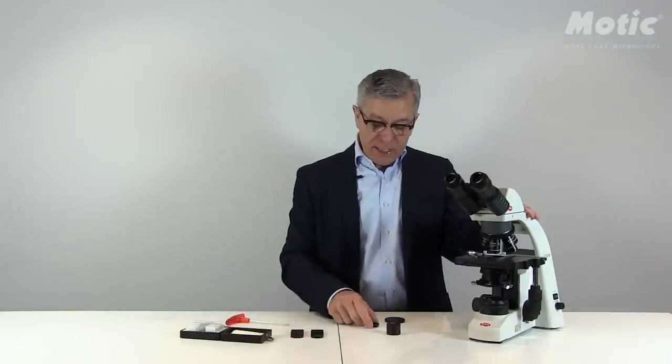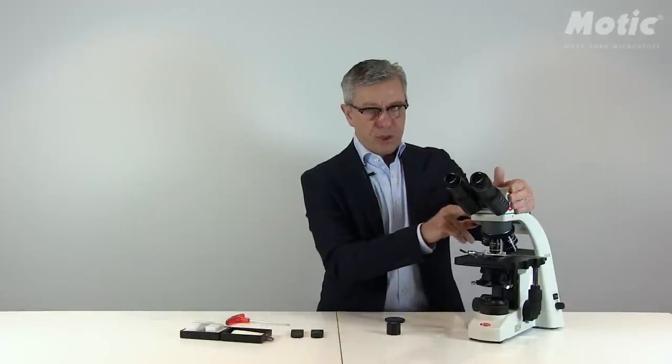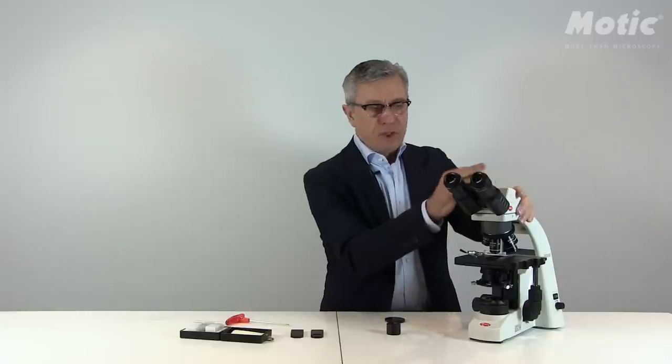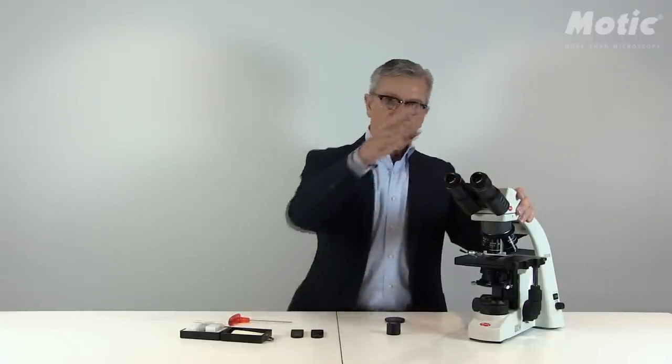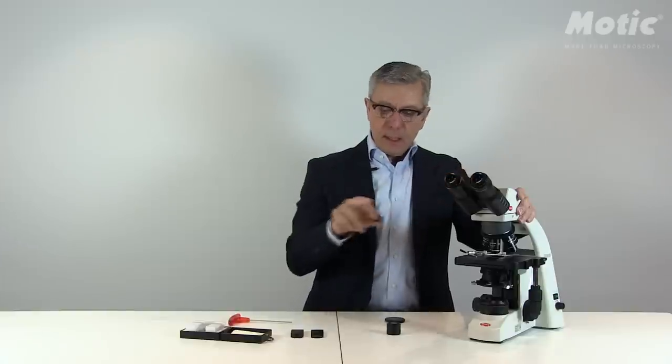As a second hardware tool, we need a so-called analyzer, which has to be placed in between the tube and the upper part of the microscope. So later on, I have to remove the tube by the Allen key and have to place the analyzer on top of the microscope. This analyzer generally is orientated in 90 degree position to the polarizer.